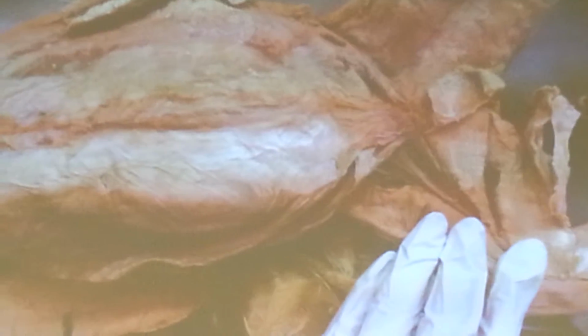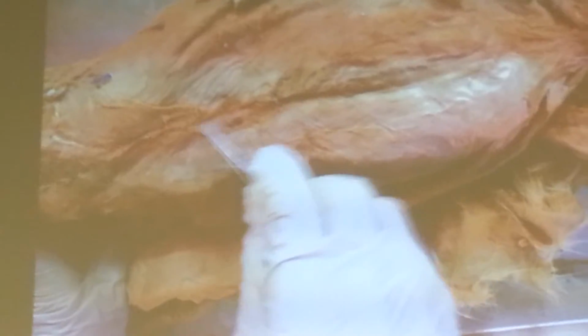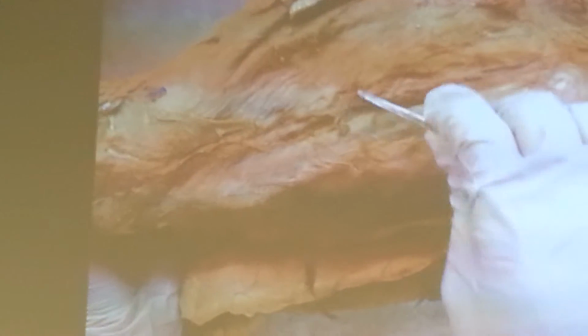Okay. Yes. Linea alba is this one. You see this line? This white line here? If I open all the fascia over this one, you will see the continuation of the starts here. But you see one part here. This part.